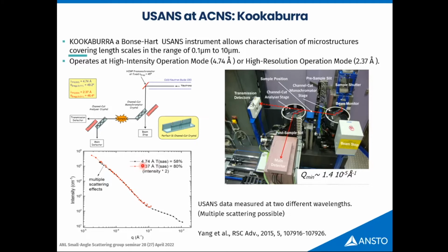Considering the setup, I think it's very flexible and very well used. Lately, it has picked up a lot in user demand, so it's a pretty popular instrument. A few years ago, the perception was that ANSTO would never be popular. Haha, not the case anymore.